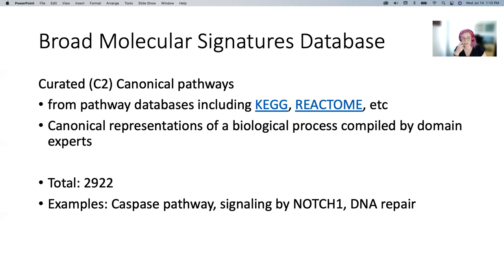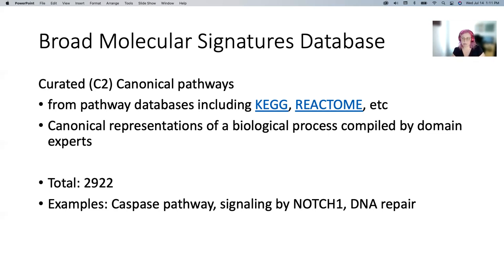Things in canonical pathways include a caspase pathway, signaling by Notch1, signaling by a specific protein or gene, and then DNA repair. So these are more action-oriented pathways.